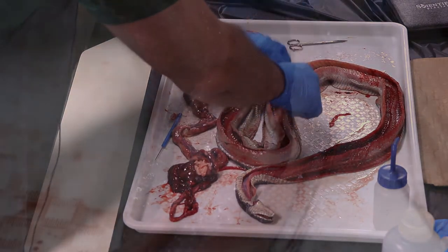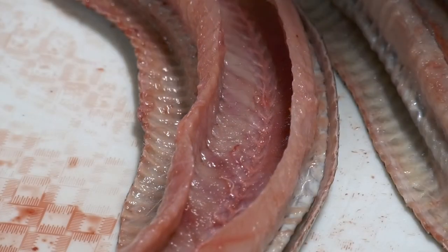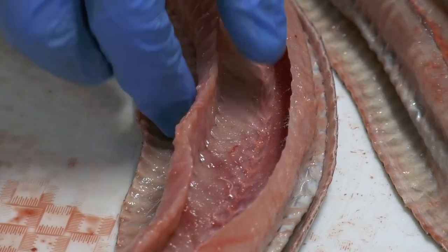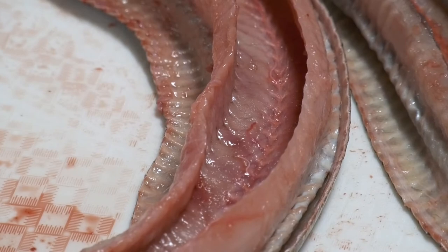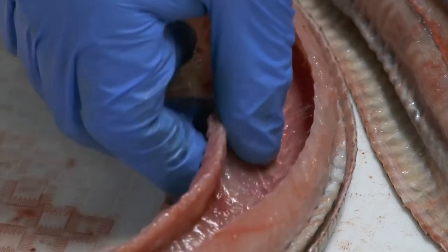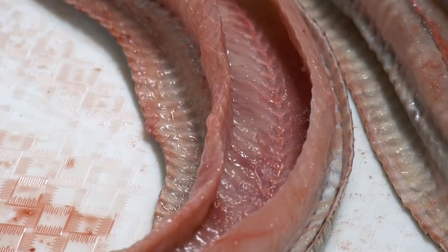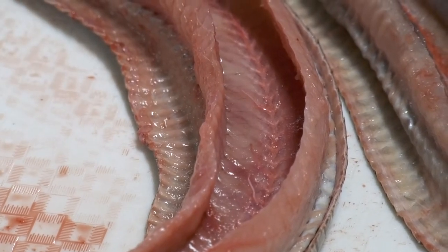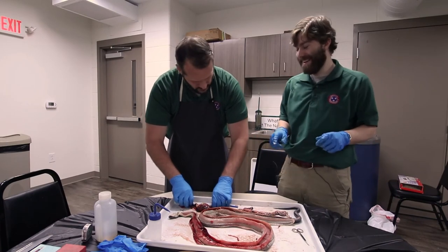Especially rat snakes, because they're very good climbers. These guys are good climbers, and to kill their prey, they're constrictors. So they have no arms or legs to handle their prey, but they have body muscles to squeeze the life right out of the prey animal that they're eating. So this gal has definitely got some strong abdominal and thoracic muscles. Look at that. Yeah, it's blowing up like a balloon.